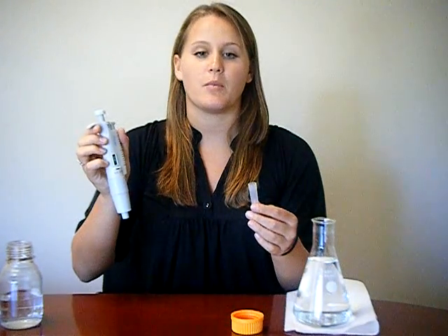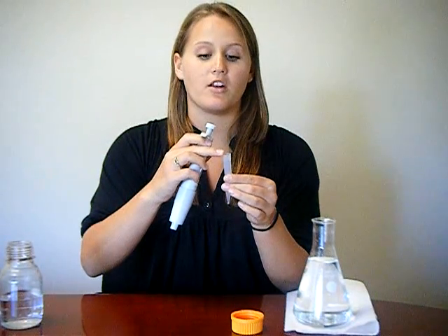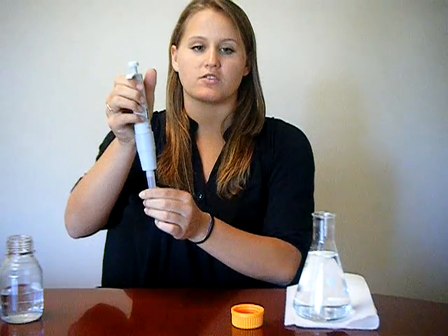To securely fit a tip on the micropipet, meet the end of the pipet to the top or the wider mouth of the tip. Press the two firmly together to make sure that they are secure.